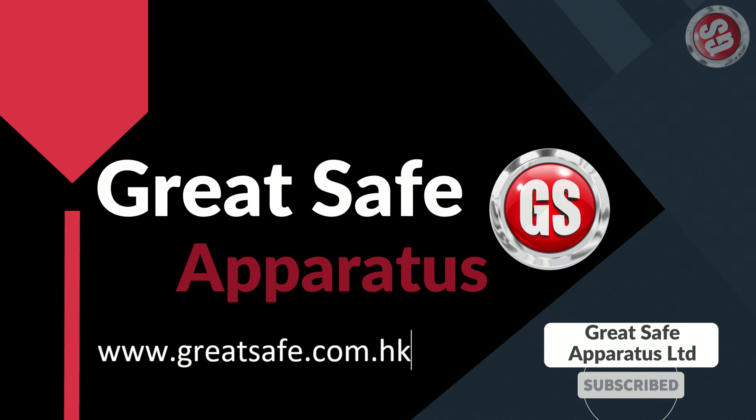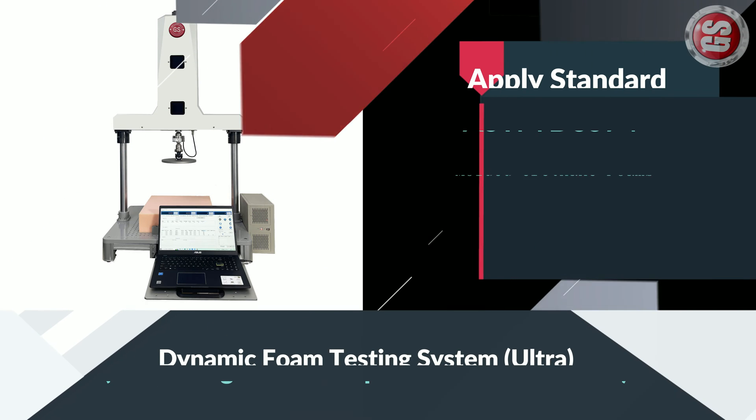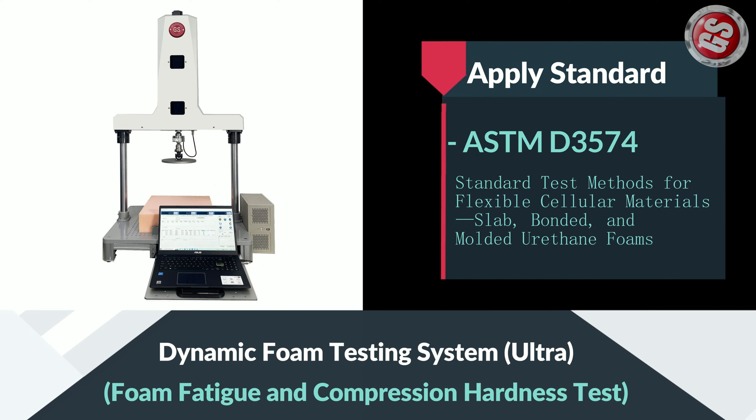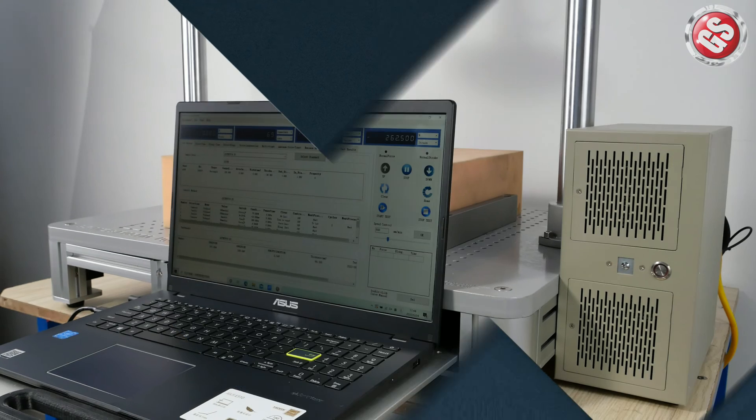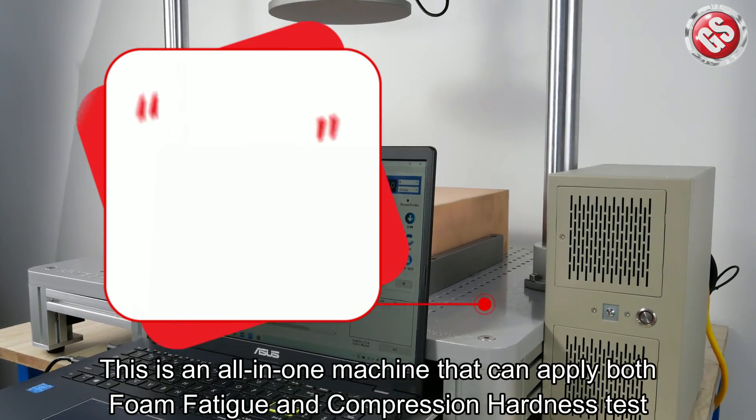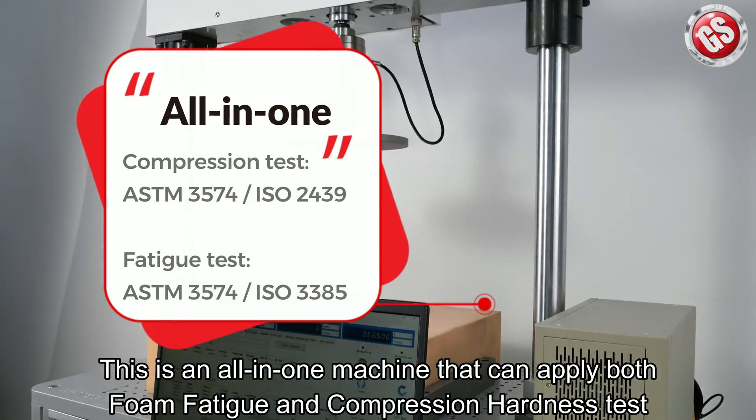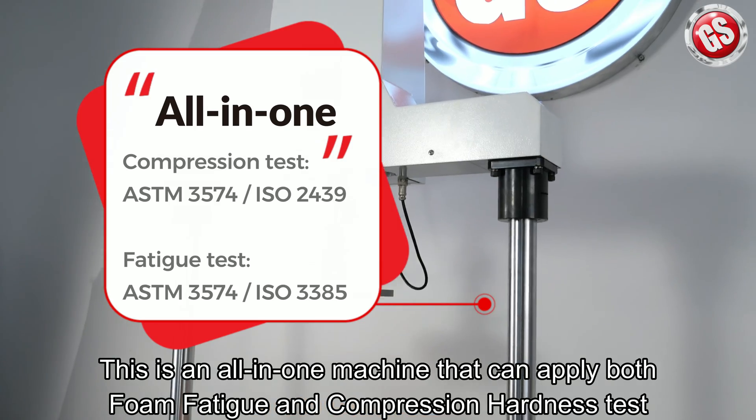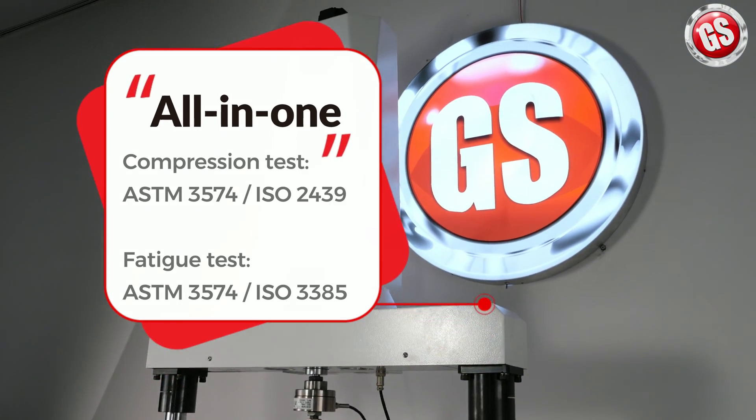Welcome to Great Safe channel. In this channel we will show you the testing machine operation. Now I will show you the dynamic foam testing system Ultra. This is an all-in-one machine that can apply both foam fatigue and compression hardness test.